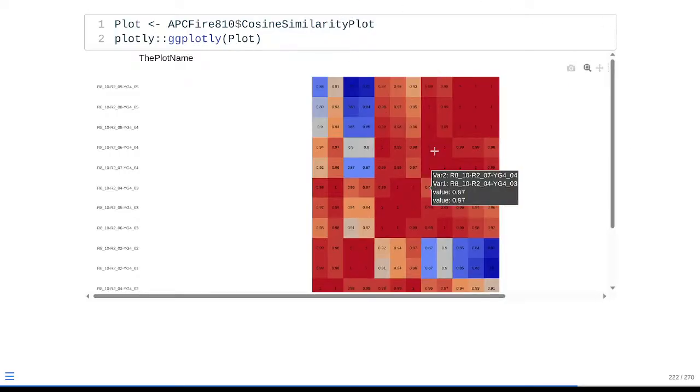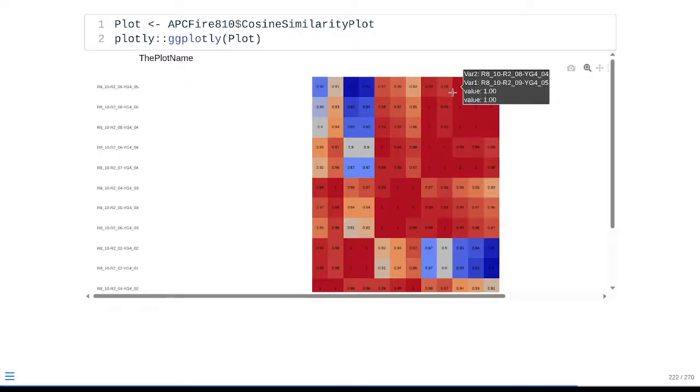You can see that these signature variants are kind of a little modal. So if your cell has a fluorophore signature on the surface that looks similar to this, they're going to unmix relatively well, versus if they're over here in this quadrant and they have that severely degraded signature, they're not going to unmix in any pleasant manner for that particular fluorophore.